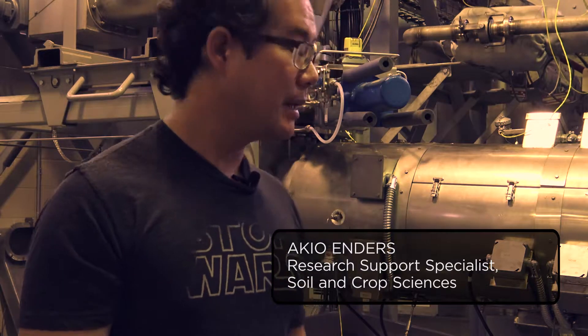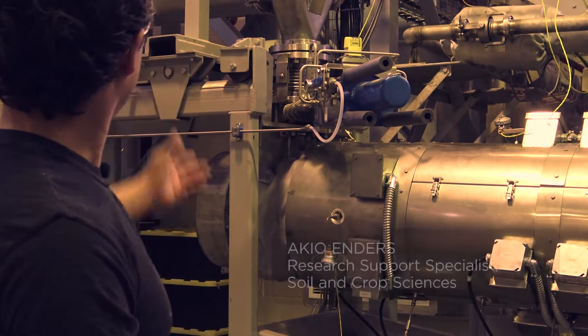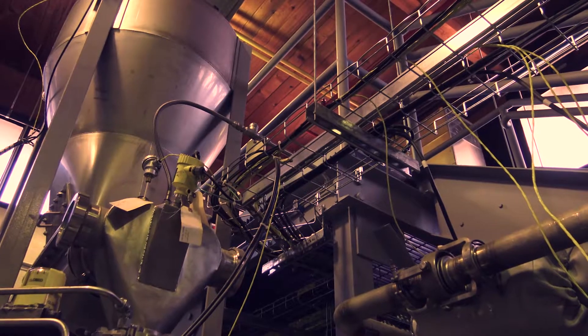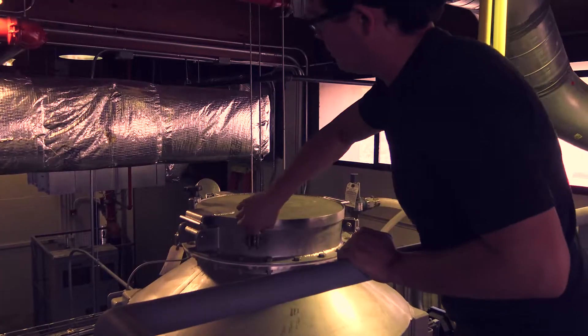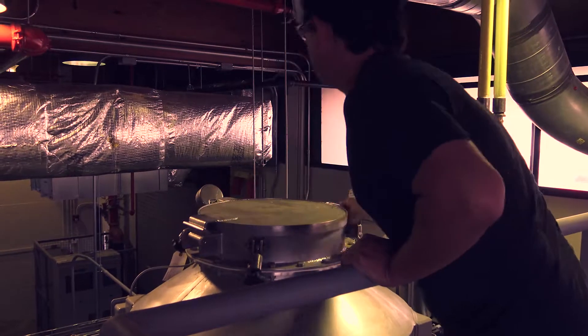This is a research grade kiln, and it gives us a lot of flexibility in the operating parameters. That cone thing — that's the hopper — we're going to fill that with biomass. That'll hold roughly two hours worth of biomass.